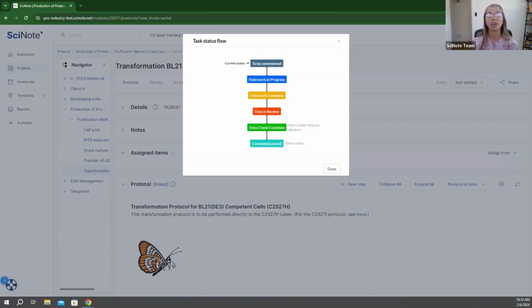Now, I'd like to ask, any questions regarding workflows? I know we have a question regarding reports, so we can cover workflow questions and reports at the same time. So what is our first question that we have here, Shama?